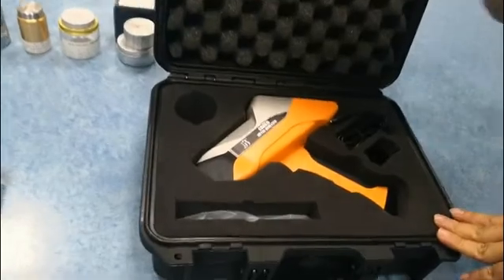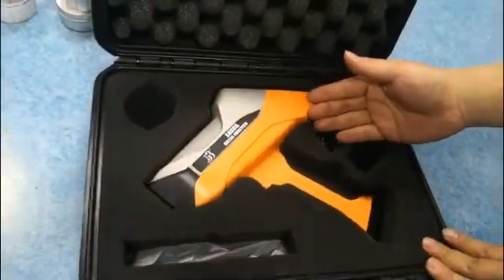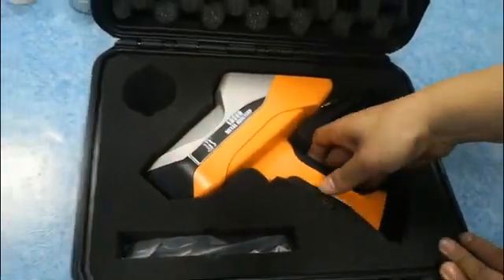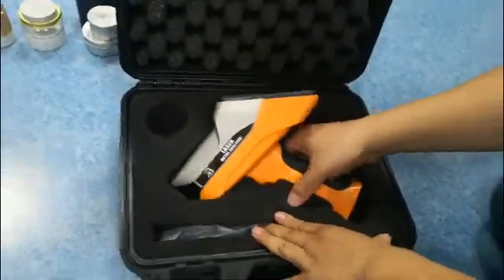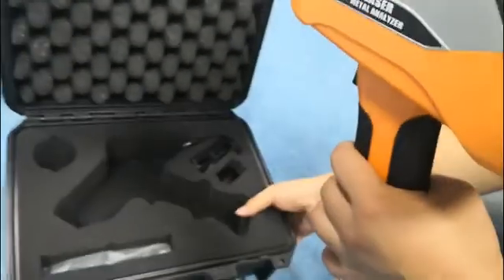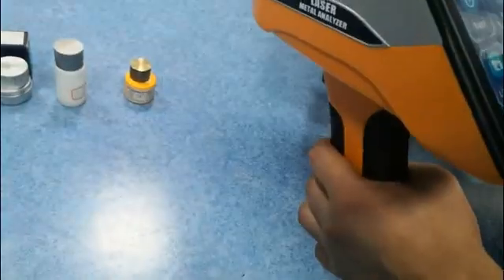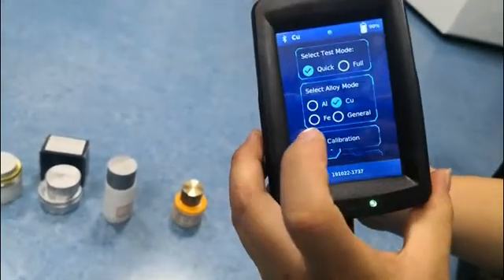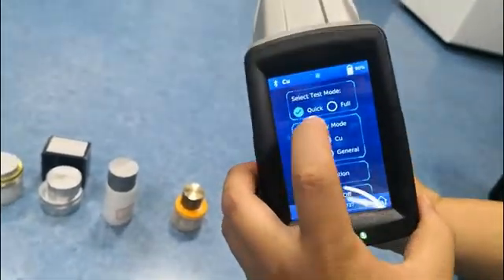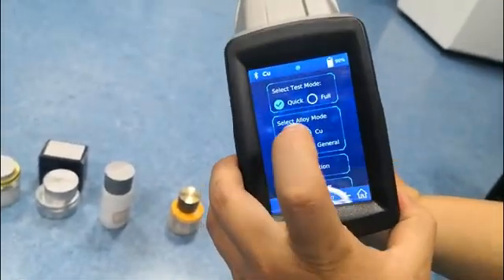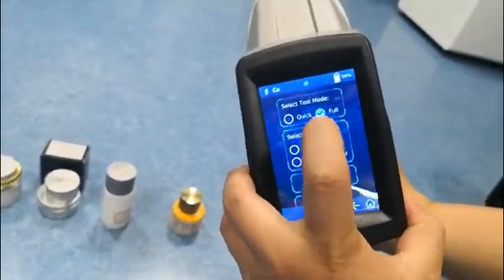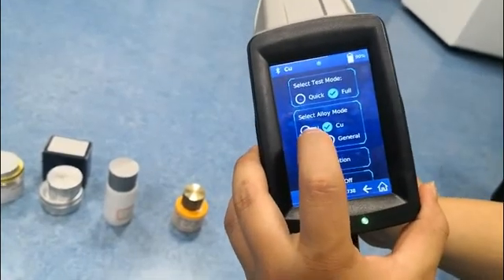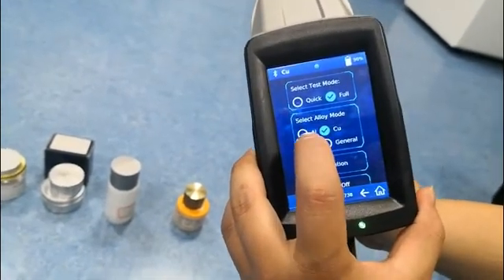This is our laser metal analyzer. Open this window. With the setting, we use our full model. Full model accuracy will be higher.